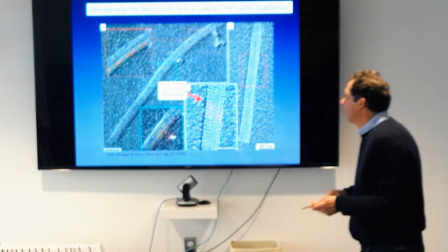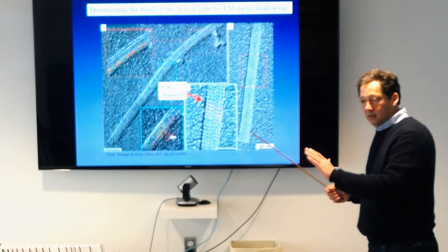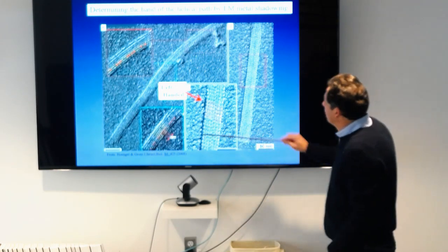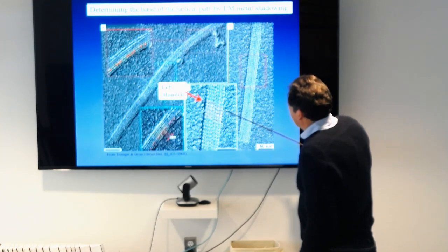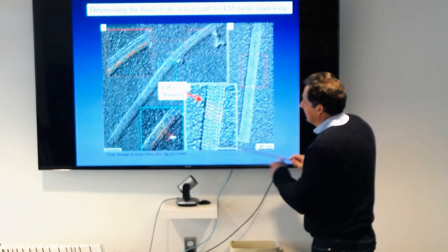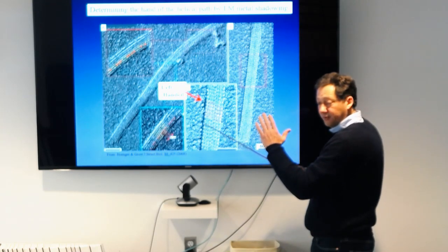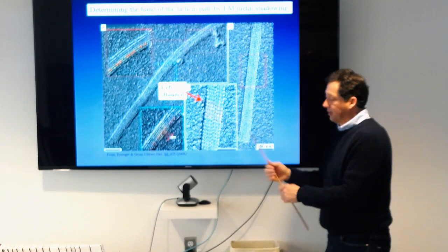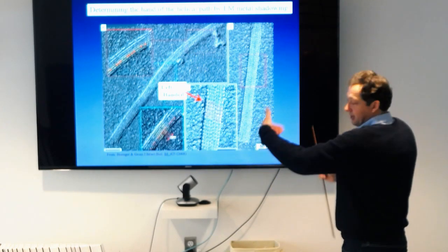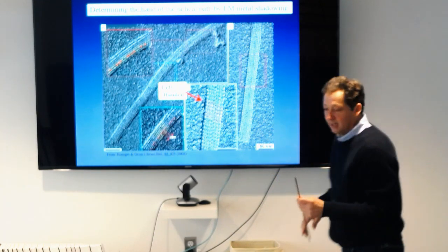One way would be to shadow your specimen, and if you keep track of everything, you can say, I'm looking at some helical paths here, or here, and I can see that these are left-handed. I'm seeing the surface from the top, so if I follow this, the helix goes left, so this is a left-handed helix.